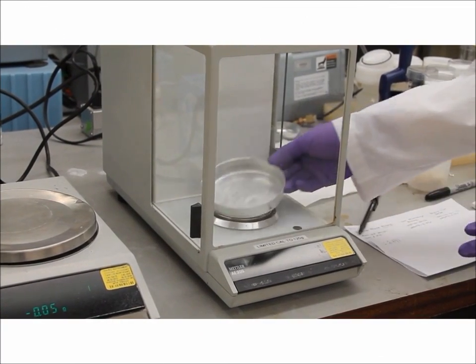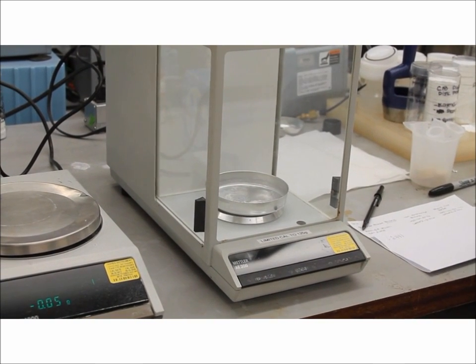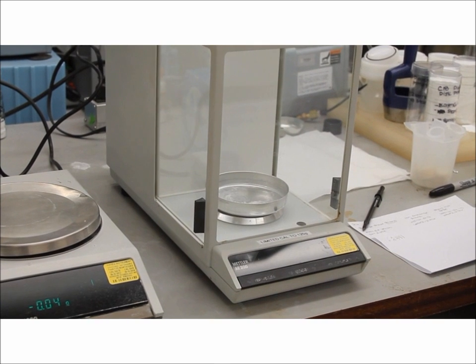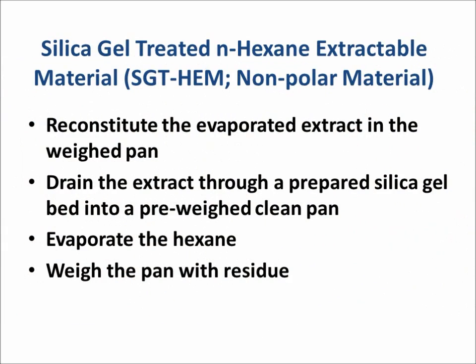Now you want to weigh your pan and subtract the initial empty pan value from the full pan value to obtain your gravimetric hexane extractable result. You have completed the measurement of N-hexane extractable material. If you also need to determine the amount of silica gel treated N-hexane extractable material or the non-polar portion of the material, you'll follow these steps and we'll show you how.